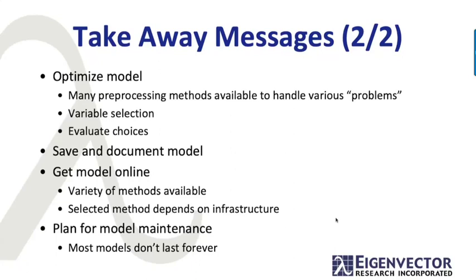Oh, so there's a question about what is the correct order of pre-processing? Okay. So there are definitely a couple of rules of thumb there. One is that almost always a step that includes mean centering ought to be last. So usually mean centering or auto scaling is last in the process.